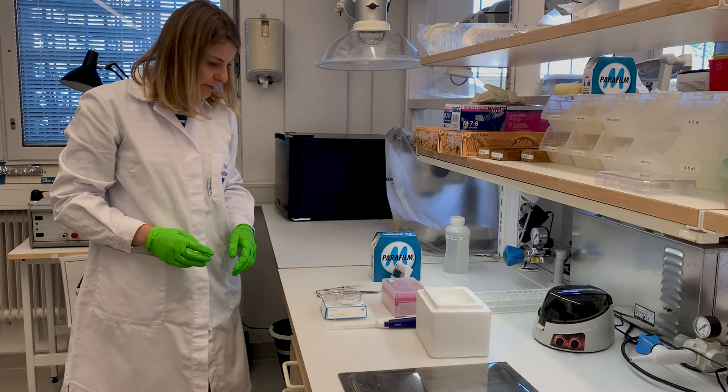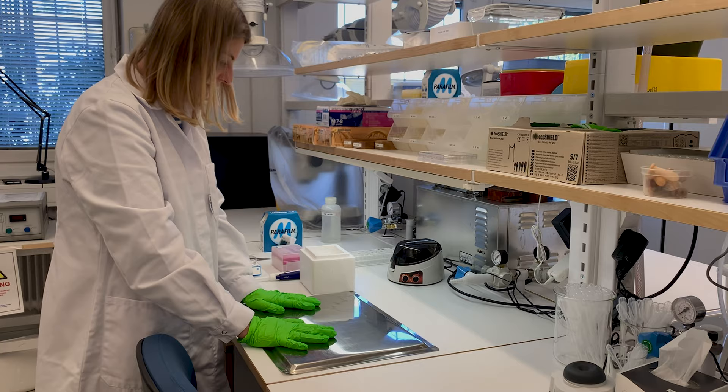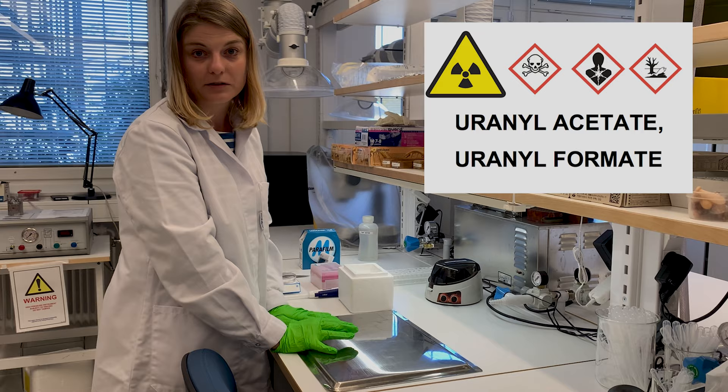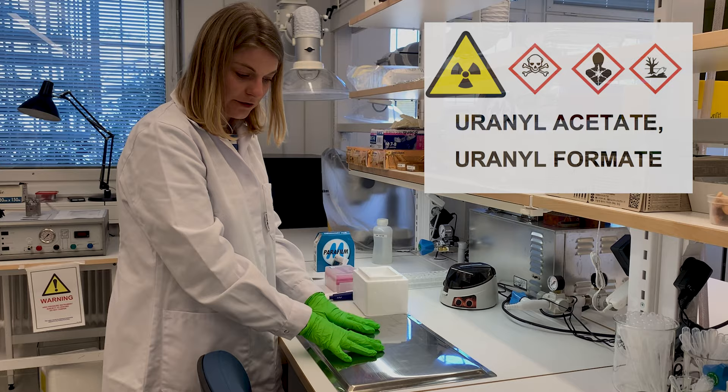In the meantime I'm just going to prepare my workspace. We try to work on this metal tray so that we can contain the contamination as much as possible. Uranyl acetate is very toxic and it's a heavy metal, so we really have to try to avoid contaminating the bench and the tray as well. But if anything, it's better if it ends up here than on the bench.